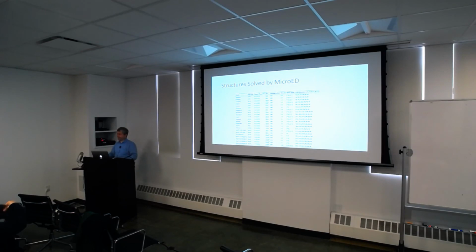Just going through my mind of all the things I've tried to crystallize that potentially have microcrystals. You still have an issue with the heterogeneity of the crystal. You might get a crystal that still may not diffract great if it's heterogeneous. Yeah, it does still have to be a high quality crystal, but hopefully if it's small enough, you're going to decrease the amount of heterogeneity compared to a bigger crystal. Presumably the reason that they can't crystallize at all most of the time is because of this heterogeneity. So unless it's a way that you're filtering out the pure parts that are okay.